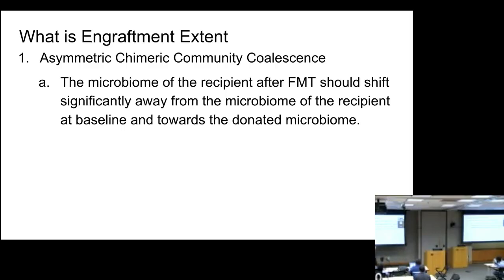So I write this down as we expect the microbiome to shift away from the donor, or sorry, I'm backwards. We expect the recipient's microbiome following FMT to shift towards the donated microbiome, and we expect it to shift away from the recipient's baseline microbiome.